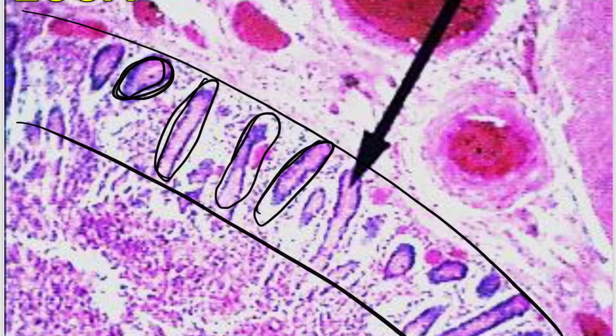When the histologist created this microscope slide, the cell may have actually faced out toward the histologist, and when it got squished between the cover slip of the slide and the actual slide itself, it got squished in a way where it didn't look long. Imagine you're squishing a hot dog, which is a nice long column shape, between two pieces of glass, but instead of laying the hot dog flat, you lay it the long way as if it's coming out toward you, and you press the piece of glass down.